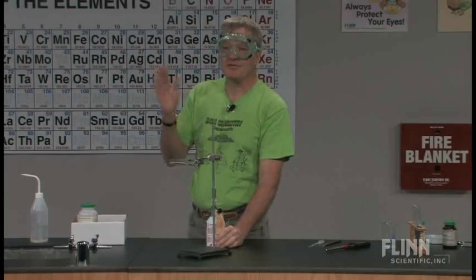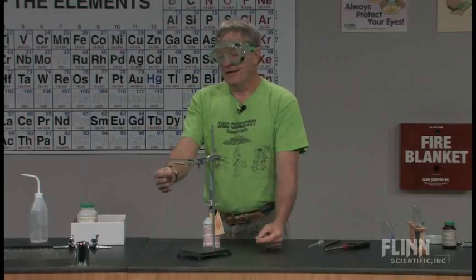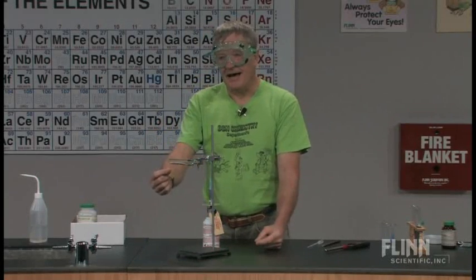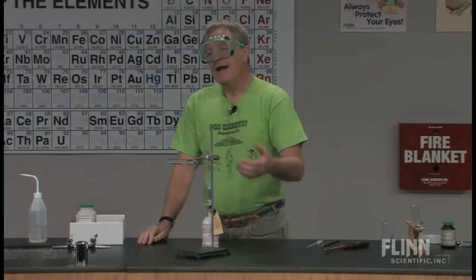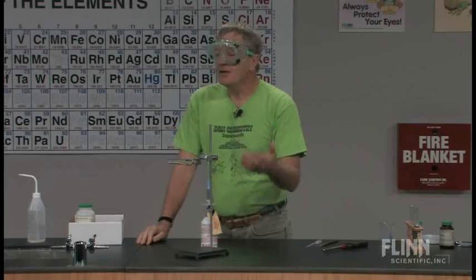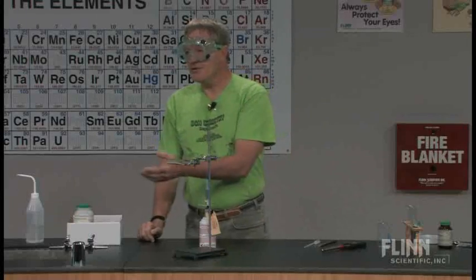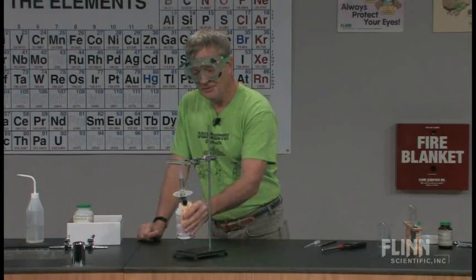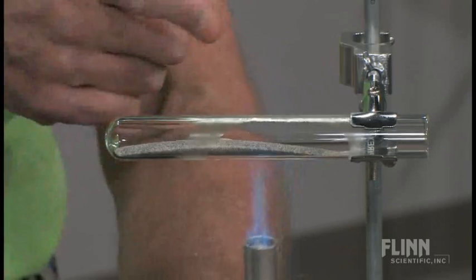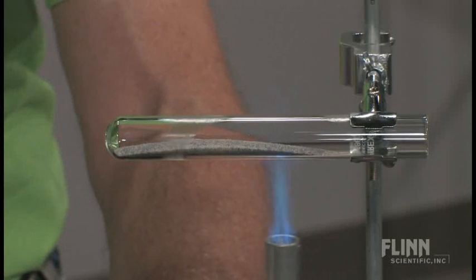And what I've done there is I've gotten rid of the moisture that was inside the test tube. After that, I've got a situation here where there's not a lot of oxygen inside the test tube. The magnesium that's in there will react with the oxygen in the test tube, and I'll get magnesium oxide. After the oxygen's been used up, the magnesium's going to start looking for something else to react with. And the only other choice in there is the sand. And actually, there's a third choice, and we'll see that too. But in fact, you can see the moisture collecting on the side, although that's really just from the combustion of the butane from this particular burner.